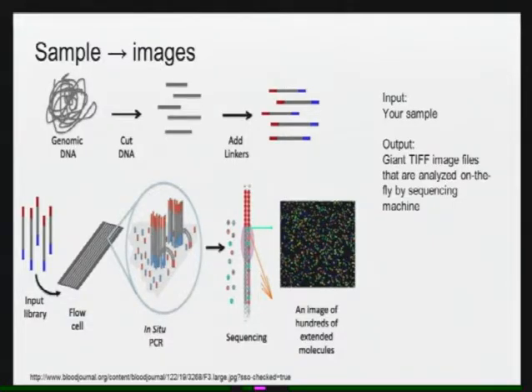So one thing that has been interesting for me to watch is how Illumina has optimized their chemistry and their software so that their cluster generation steps can pack in clusters more tightly, which allows you to get more fragments on a chip and separate them more cleanly, so that you can get more data out of a single run on a flow cell.